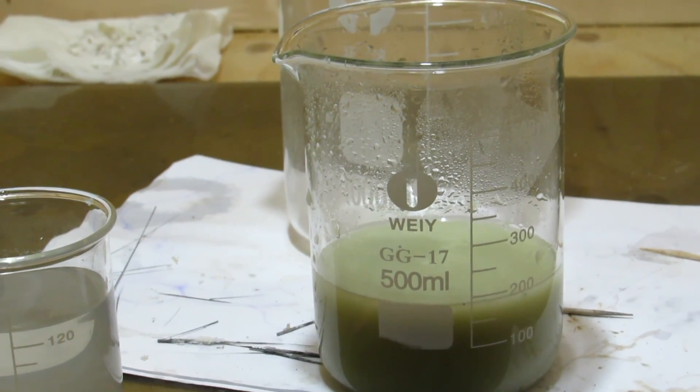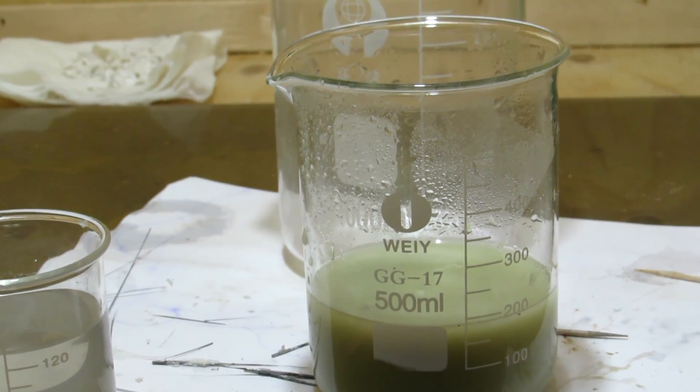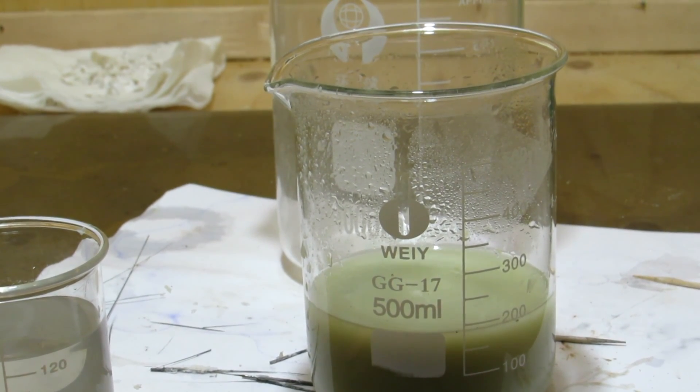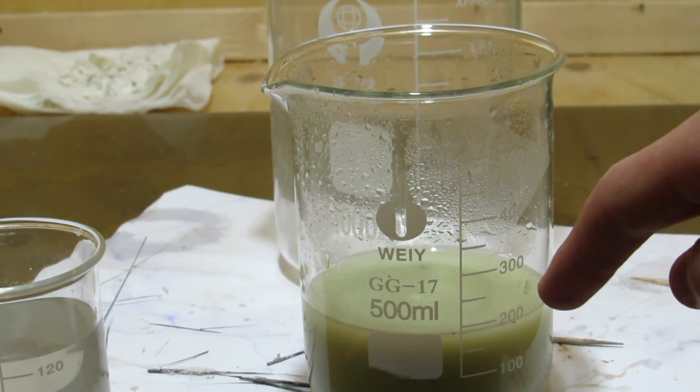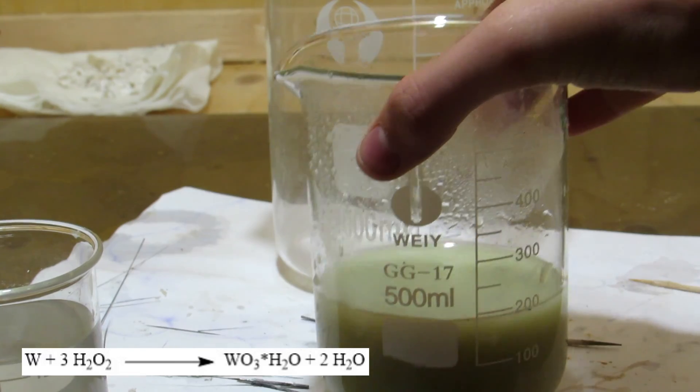The thorium dioxide also contained bits of undissolved tungsten, so the large chunks of rod were removed, and the thorium dioxide was rinsed and then added to about 200 milliliters of 30% hydrogen peroxide to finish dissolving the remaining tungsten.